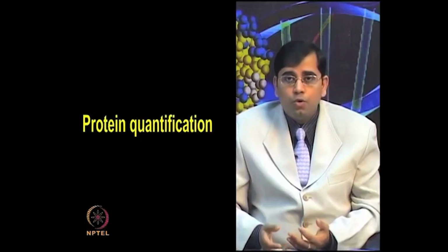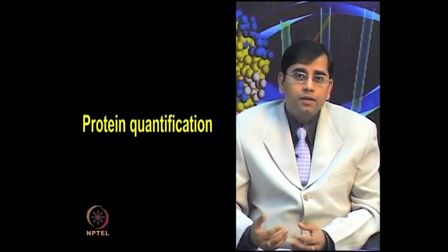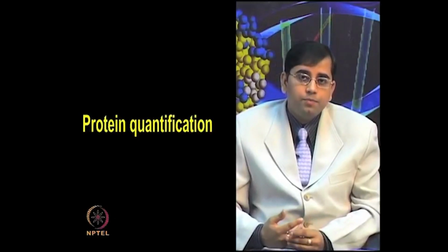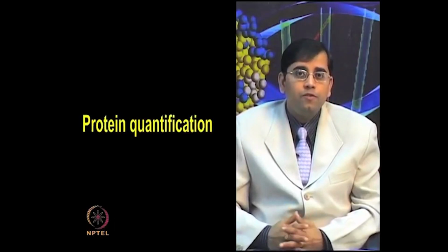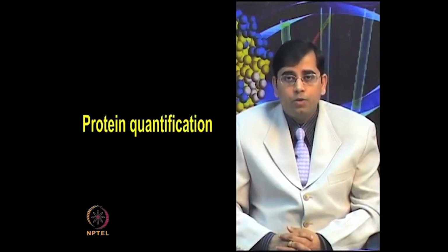Now, you want to know how much protein you have in your sample, whether you can perform your experiment with that protein or not. So, one needs to know the protein quantity present in the protein sample. There are different types of protein quantification methods available. We will talk about protein quantification in detail now.